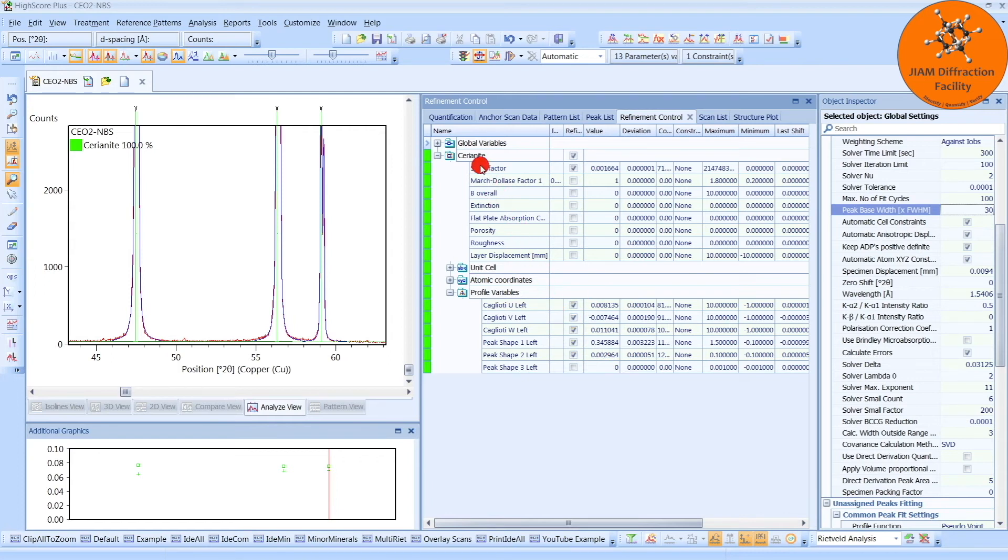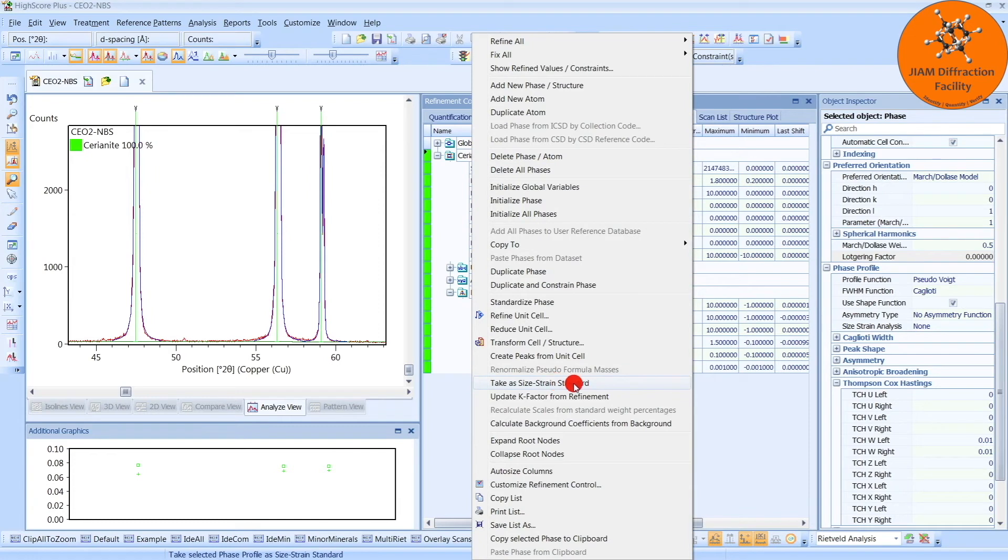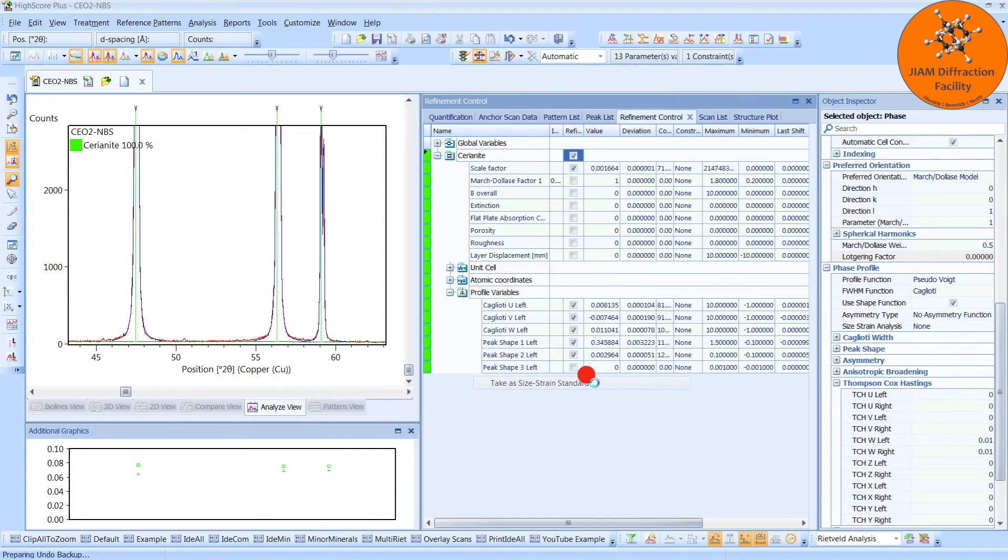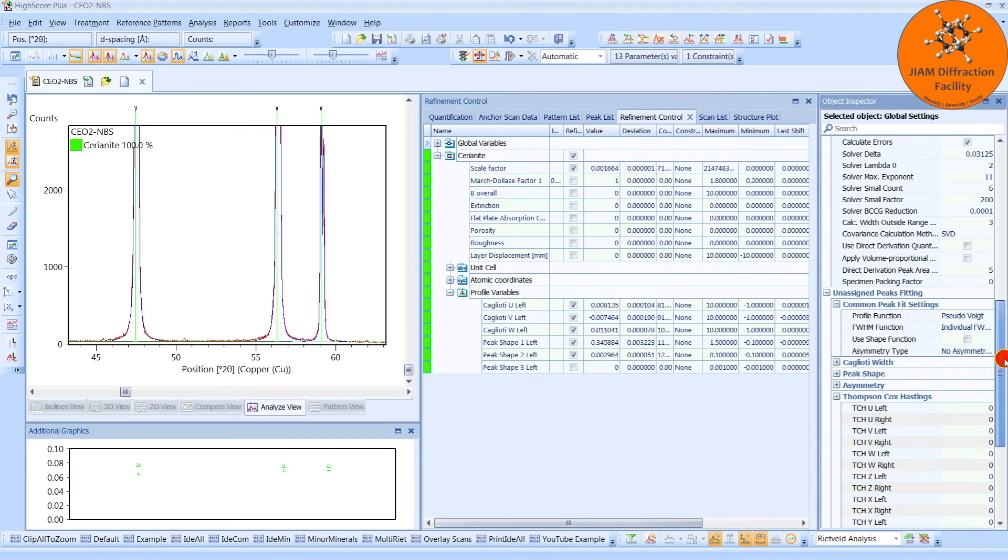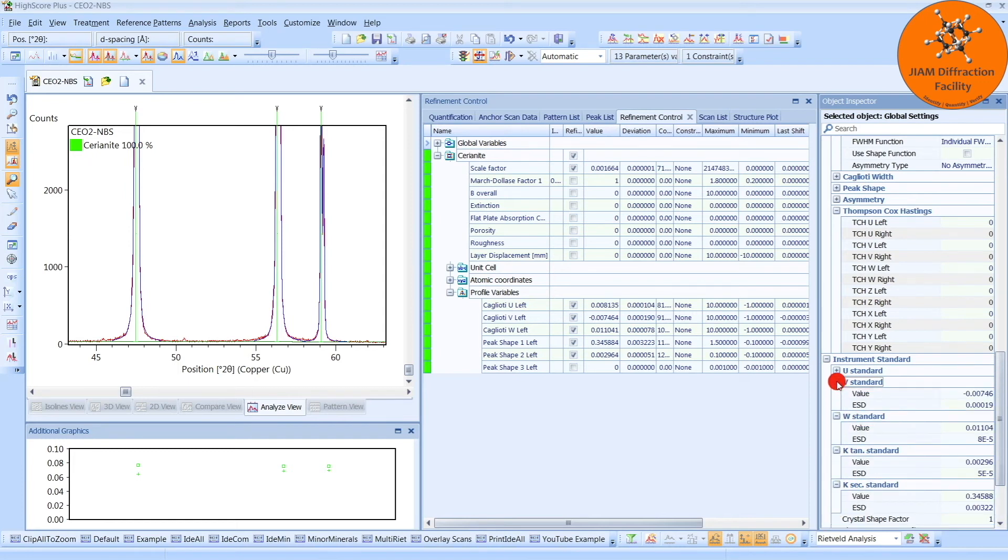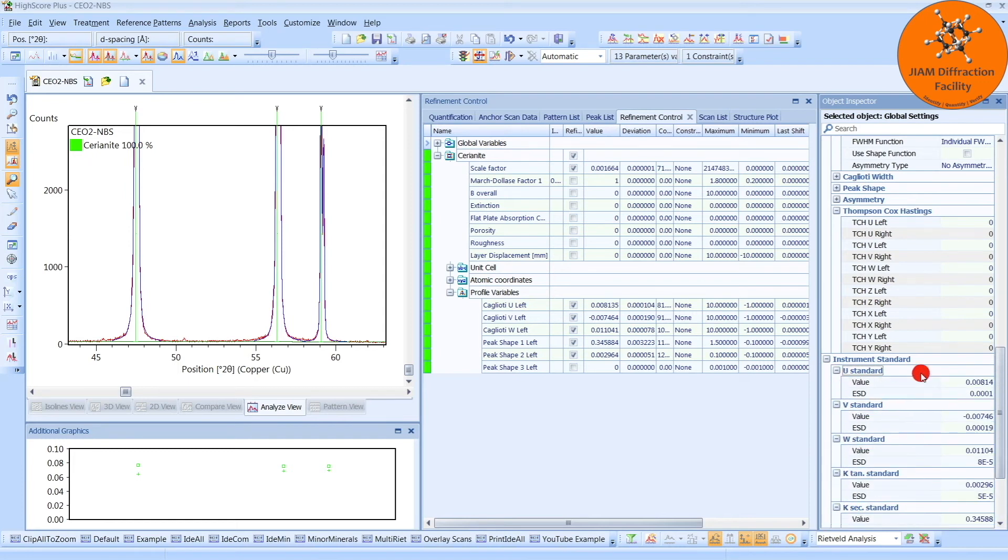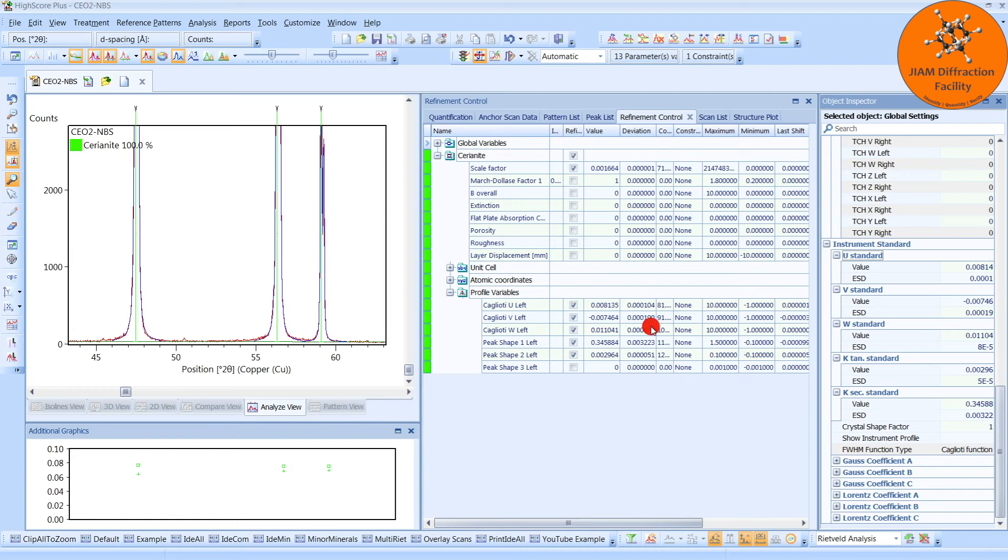To do that, we right-click the phase and then come down here to take as size strain standard. Left-click it. If we then left-click global variables, we can then scroll down all the way. And under instrument standard, we see U, V, W, and then two K standards. If you expand those, you should see these values match these values here. So now we have our instrumental broadening saved.